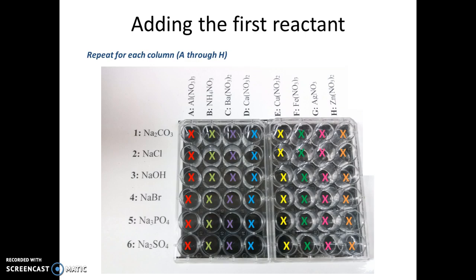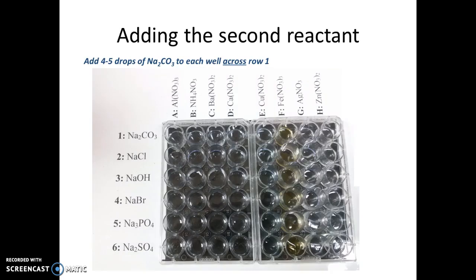At this point you've added one reactant to each well in your plates. It's sort of hard to see these clear solutions, but at this point I have one solution in each well, representing just one of my reactants.